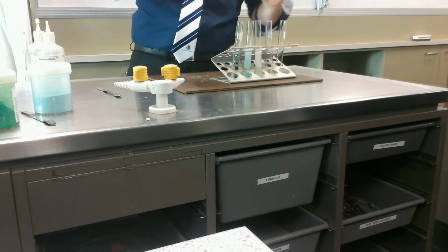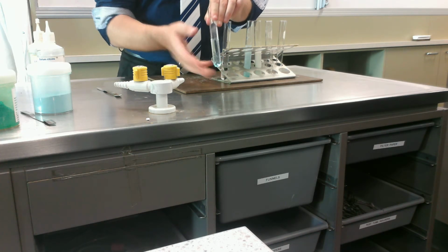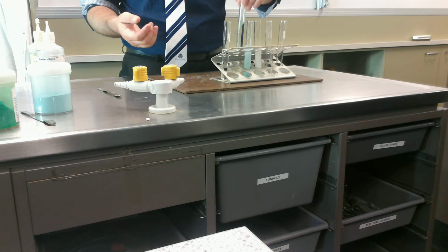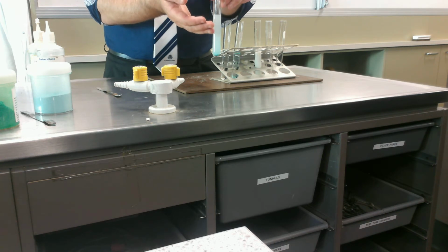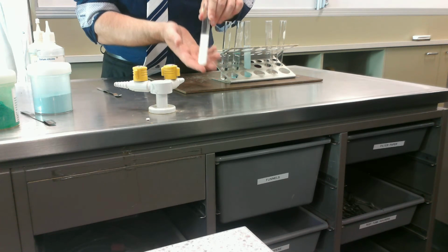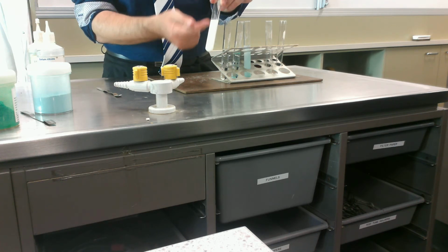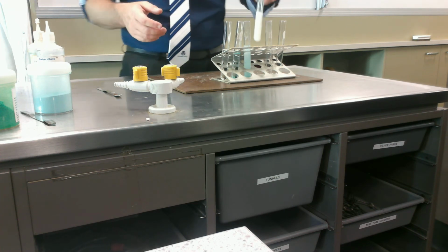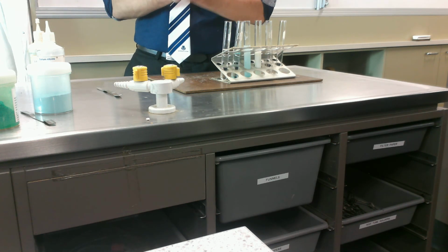So let's just go through it again. We have a colourless solution made by putting a crystal into water that dissolved. A coloured solution by putting a crystal or a salt into water that did dissolve and had a colour to it. We have got a suspension, you can see it's starting to settle out already, where I put a solid into some water and it didn't dissolve, it was insoluble. And we have a precipitate, which is formed by adding two solutions together and it ended up making a suspension. So we give it a slightly different name, precipitation. Okay, and that's what you're going to be learning about for today and Thursday and maybe Monday next week. All right, so we'll stop the video there.